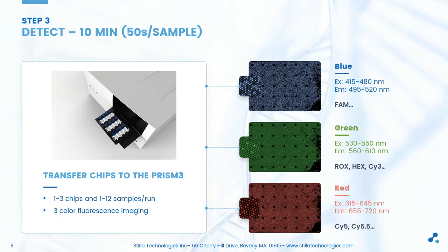When multiplexing with TaqMan probes, custom probe combinations can be chosen as long as they match the wavelengths displayed here. The main fluorophores used in molecular biology are compatible with the system.